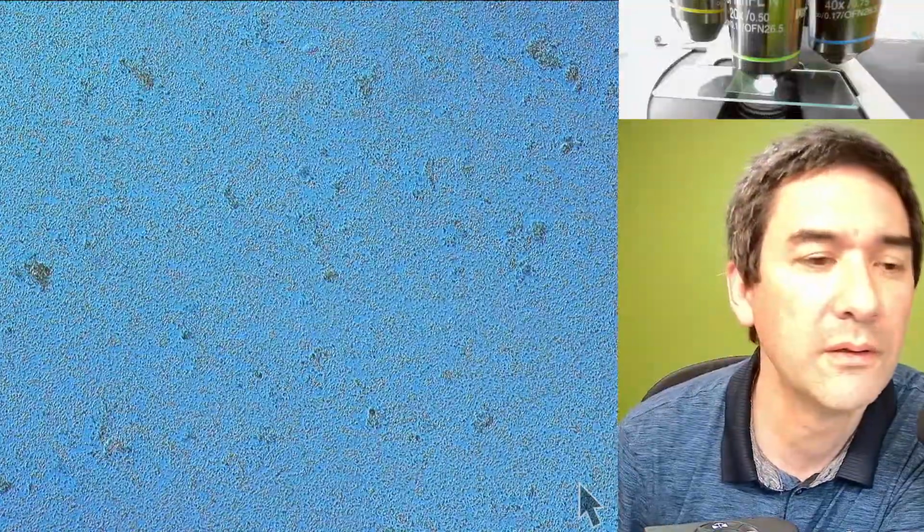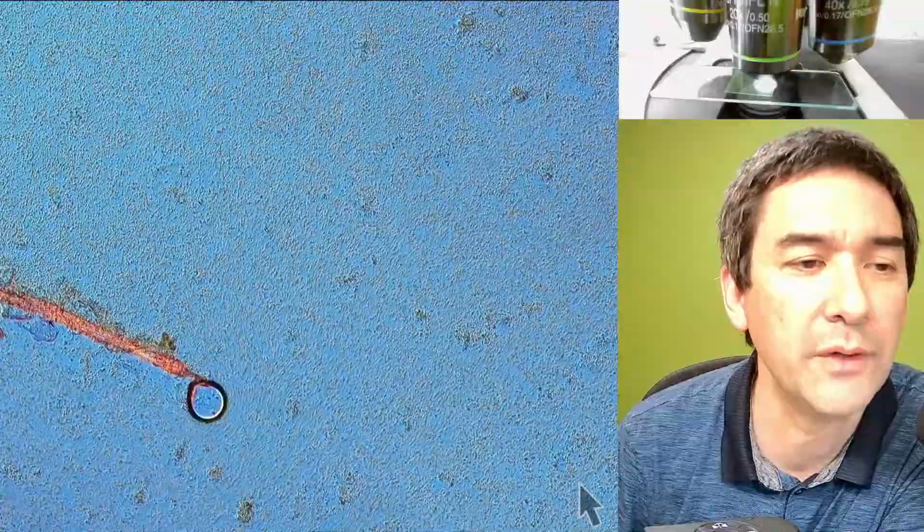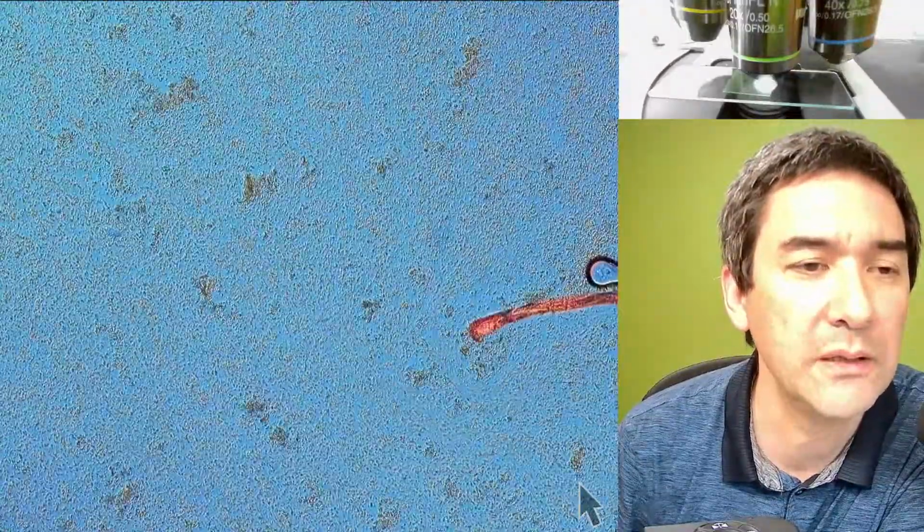So I'm going to do the following. I'm going to turn on DIC to increase the contrast. So I'm now at 20 times. So the streaming motion that you see is because of the spreading of the liquid beneath the cover glass, right? So that's completely normal. But I don't know.